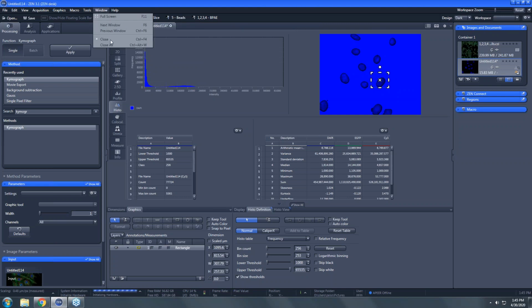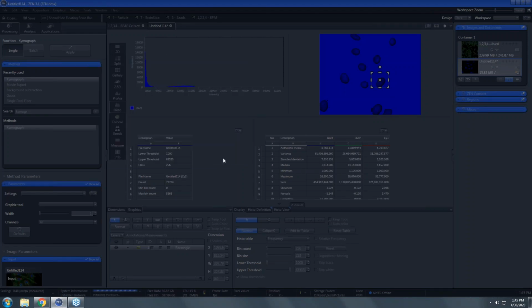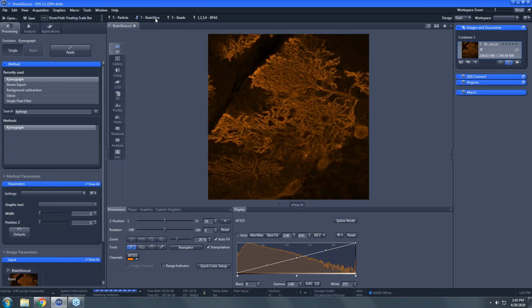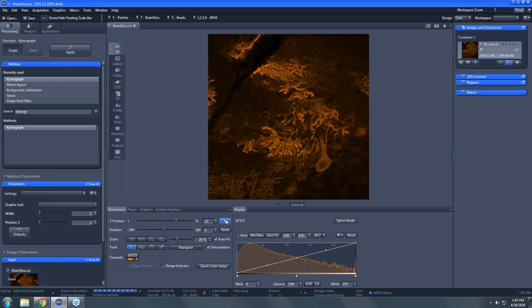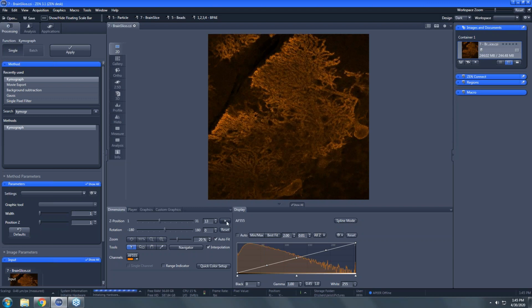So we're going to shut these images down and we're going to get up a nice brain slice stack. I say nice. It's not super nice, because if it was, we wouldn't be able to do much in terms of processing and improving it. This is a Z stack of a coronal brain slice where we've captured a number of cells with a rather complex tree of extensions, and we can see spines on these if we zoom in. Trust me at this zoom level, but they are there.